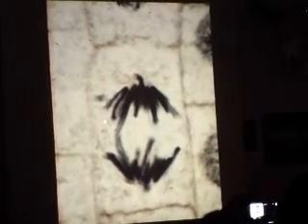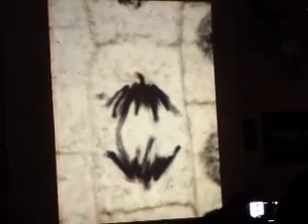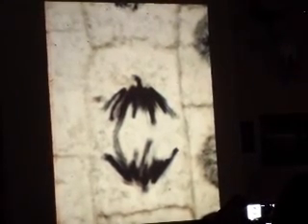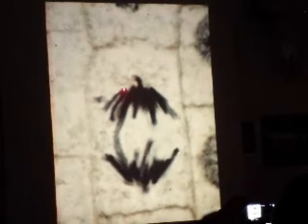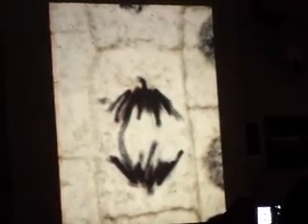What phase? Anaphase. And what's this whole V-shaped thing called? A daughter chromosome. And then the parts of the chromosome are at the end right here. Centromere, and here, chromatid.